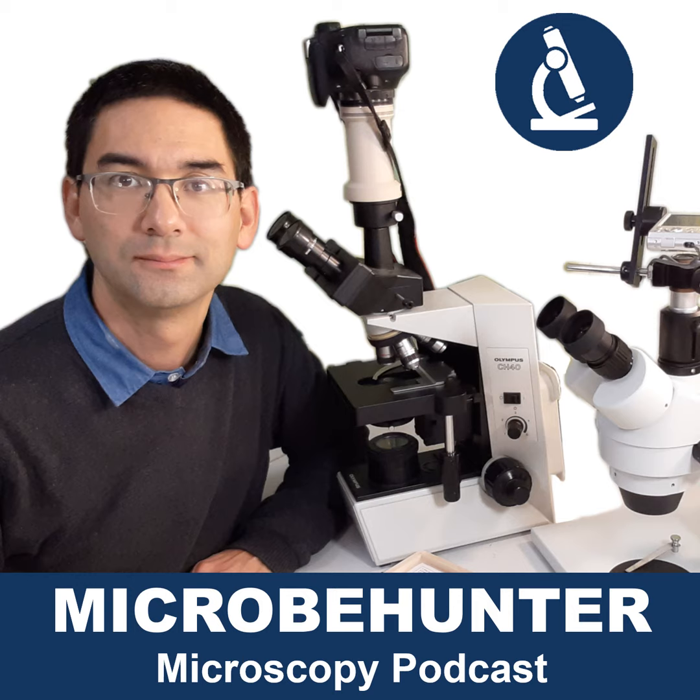Compound microscopes, however, do not give you a stereoscopic image. Even those compound microscopes where you have two eyepieces to look through, because there is only one objective, both eyes will receive the same image information. There is no sense of depth in compound microscopes, even if you look through two different eyepieces, okay. So now, what about if you cannot decide?